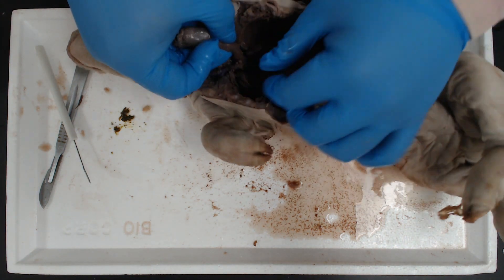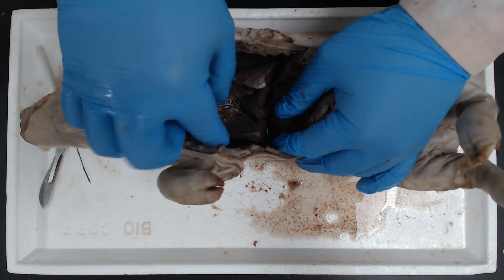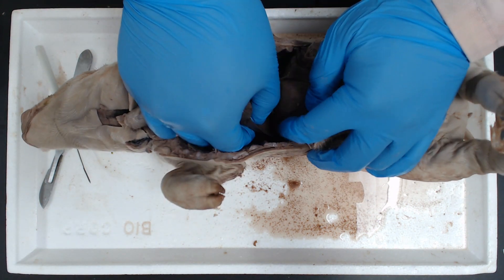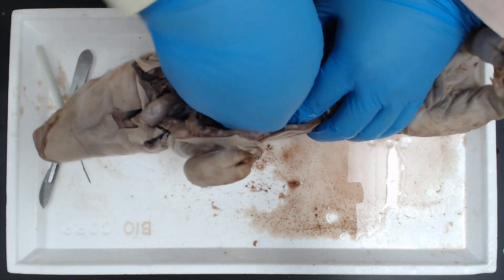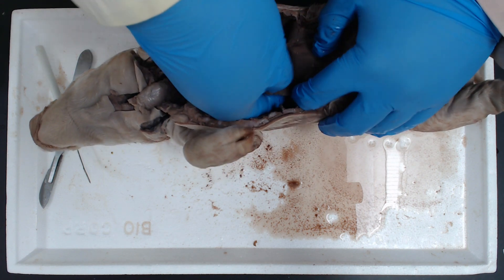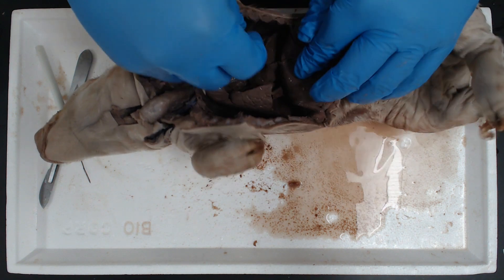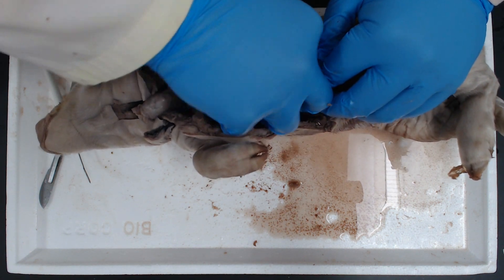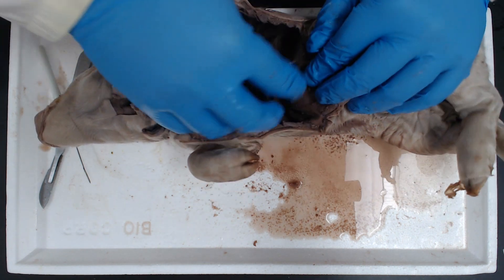Now, since our trachea is freed up, we need to free up our lungs too. The lungs will have a little piece of connective tissue connecting their ends — the most inferior lobe — to the diaphragm. If you just run your finger along it, it will just pop. There we go. Do it to the other side — it is a very thin connection, it should just pop. There we go.